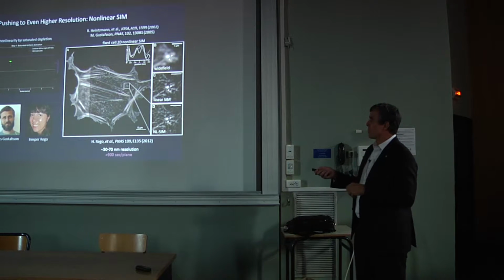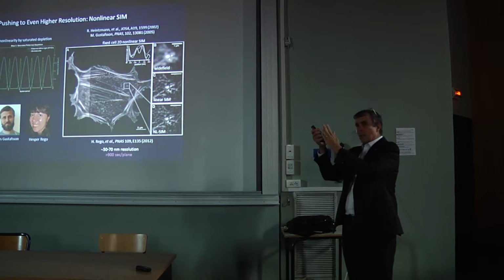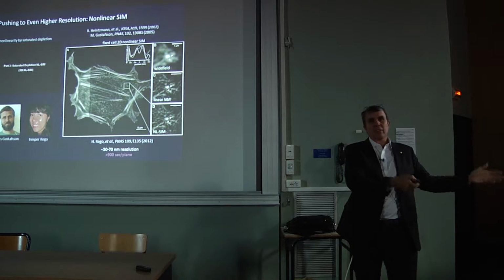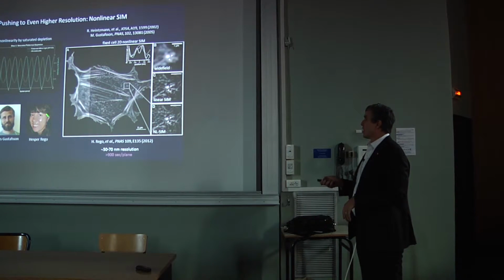the few that reside. Here's turning them on, and now we're going to turn on the standing wave to deplete all of the molecules except the ones at the nodes of the standing wave. So you have little narrow spikes of fluorescent molecules. Those have higher Fourier components, which allow you to demodulate even higher spatial frequencies and get well beyond the factor of 2 beyond the diffraction limit.